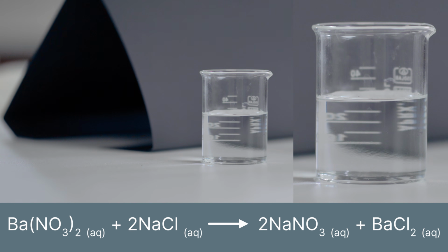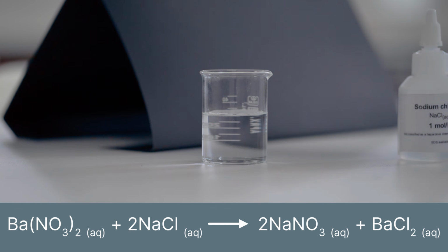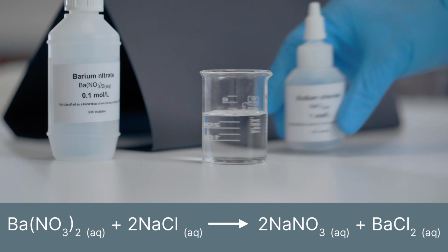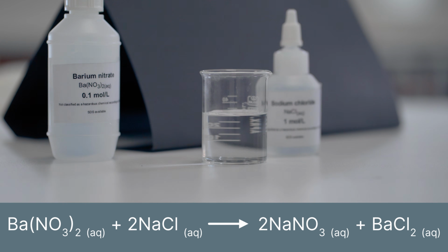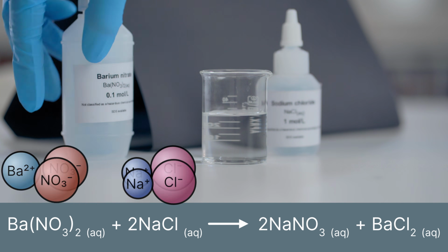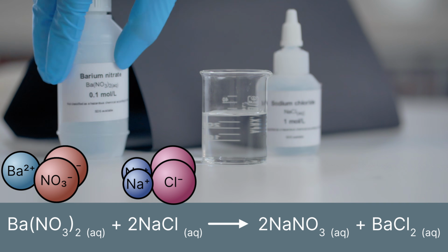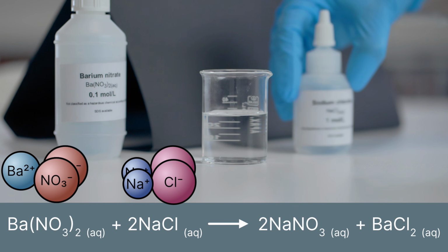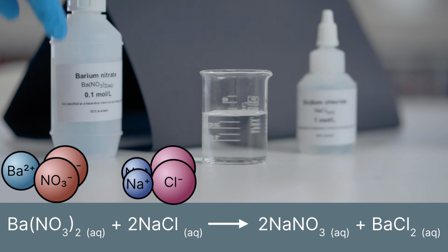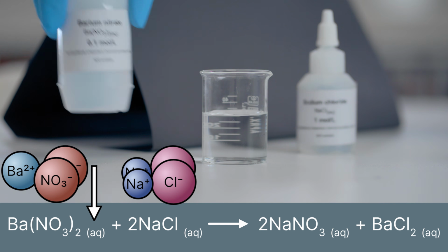Okay, so we can see that we don't have a chemical reaction between these two. So let's talk about that. Well, this is going to come down to solubility rules, where we notice that certain combinations of ions, so barium ions, nitrate ions, sodium ions, and chloride ions, there's actually a table you can look up and determine if you have certain combinations present. So for example, I have barium and nitrate, and I look it up on the table, we see that that combination is soluble, or has high solubility, hence why it's dissolved.